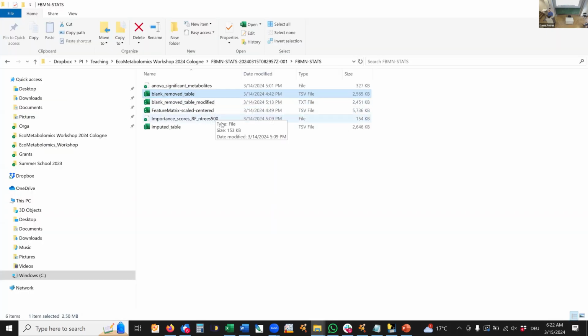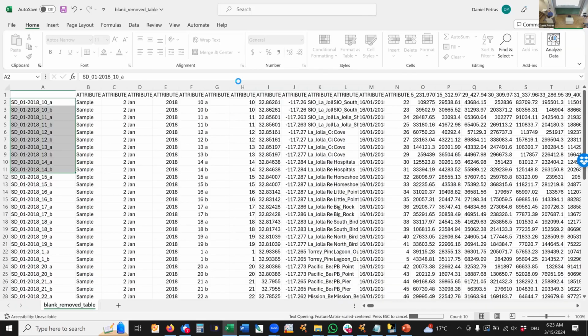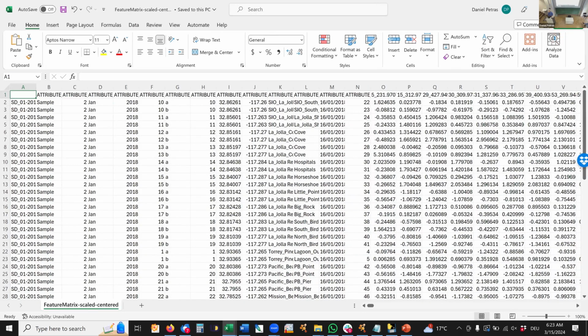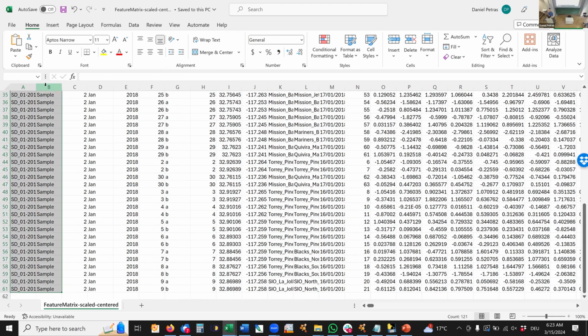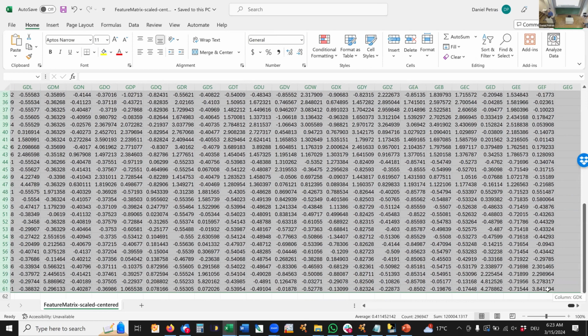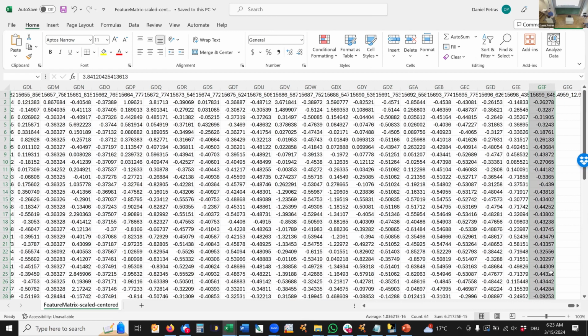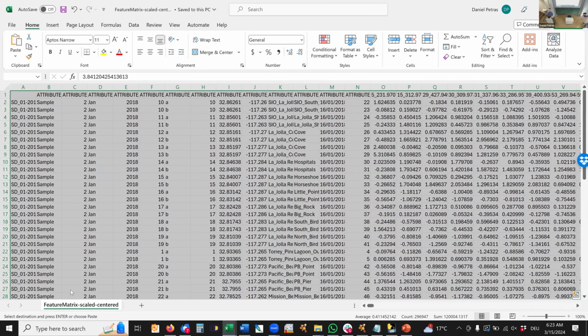if that is already back transposed. If not, I have to do it manually, or I have to do it in one step in Excel. Okay, it's the same thing. So, all right. Then I'm just going to take that full table here. Oops. And copy it into a new sheet.